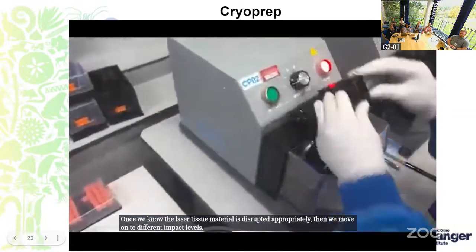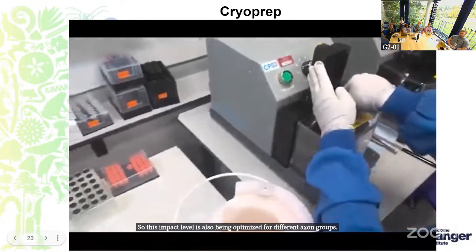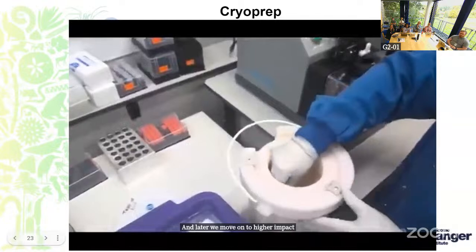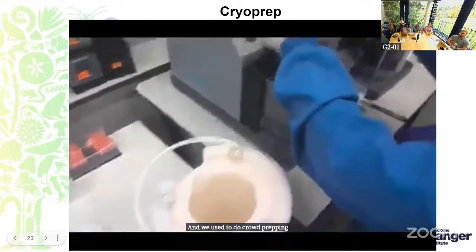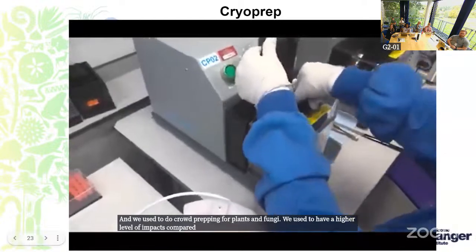Once we know the larger tissue material is disrupted appropriately, then we move on to different impact levels. This impact level is also being optimized for different taxon groups. For instance, for this sample, we start off with 1 and then move on to 2, and later we move on to higher impacts based on the disruption it requires. When we used to do cryoprepping for plants and fungi, we used a higher level of impacts compared to the mollusk and chordate samples.